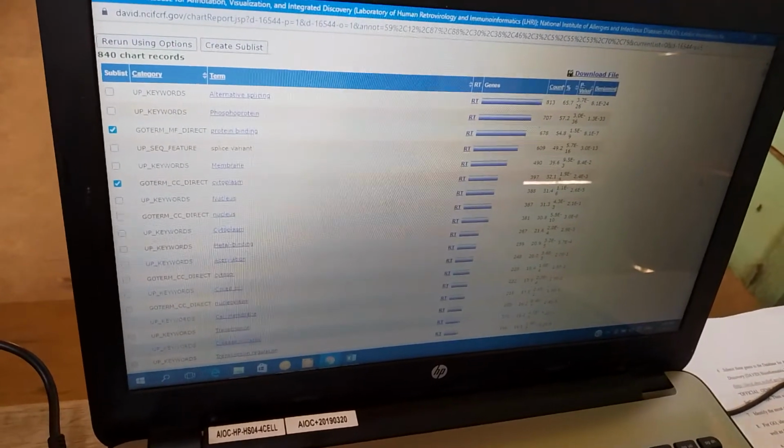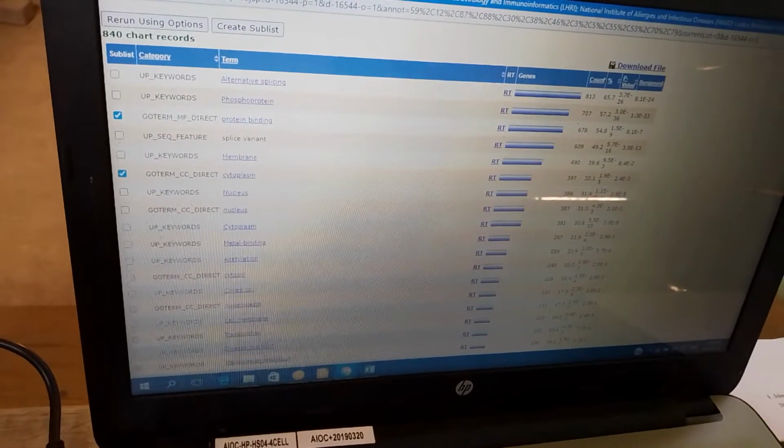It's telling us that it's protein binding. So most of these genes that are targeted by this microRNA may be involved in protein binding. Okay? When they are involved in protein binding as the molecular function, what may they be doing there? They might be carrying out transcription as the biological process tells us. So you see how we are interpreting the information. Okay? Yes.